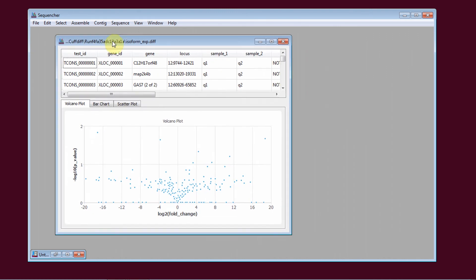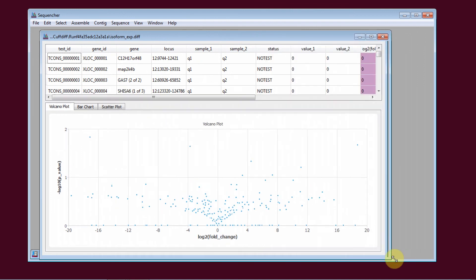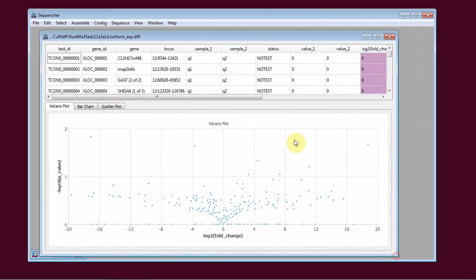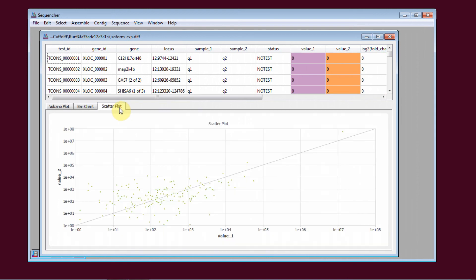In this window, in the top pane, you see the data in tabular form. And on the bottom pane, you have the plots and charts. You can choose from the volcano plot, the bar chart, or a scatter plot.